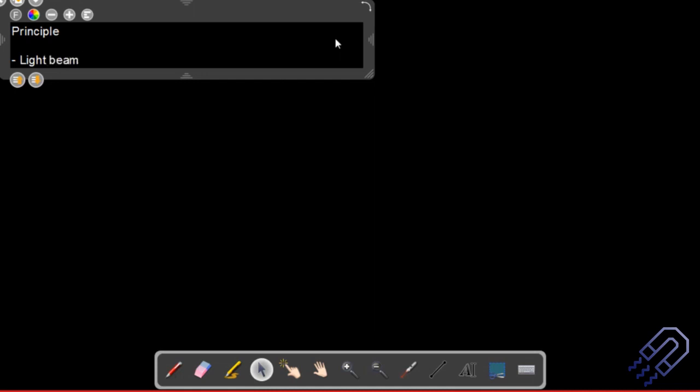What we have is a light beam. Now this light beam might be a UV, might be a visible source, or might be an IR source. It will basically fall on the object. Once it falls on the object, we basically have a signal, and that signal might be of different wavelength depending on what kind of radiation has fallen on the sample.